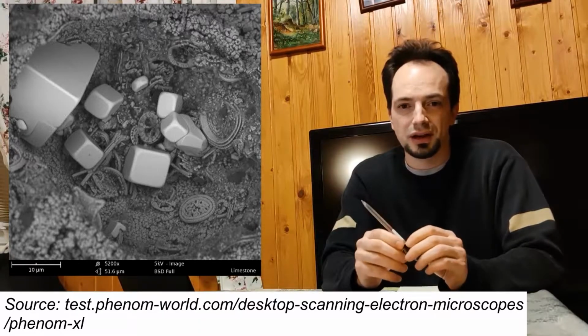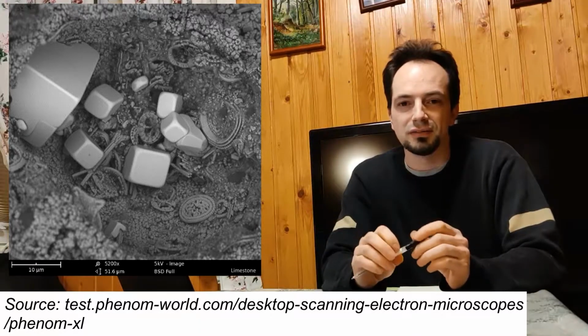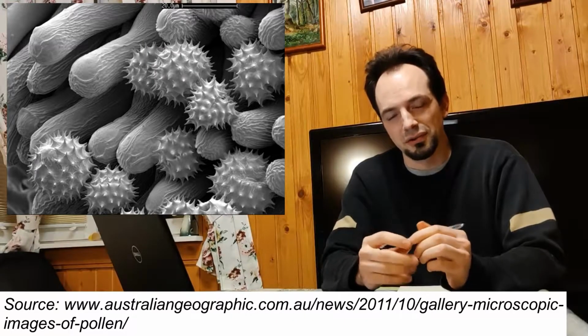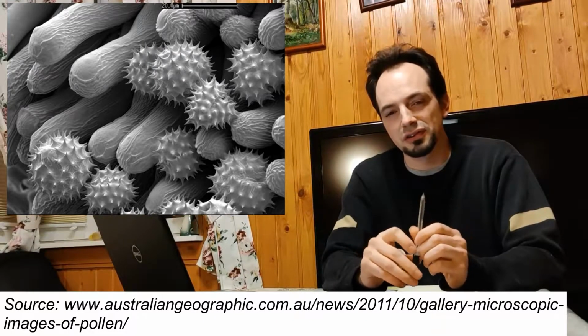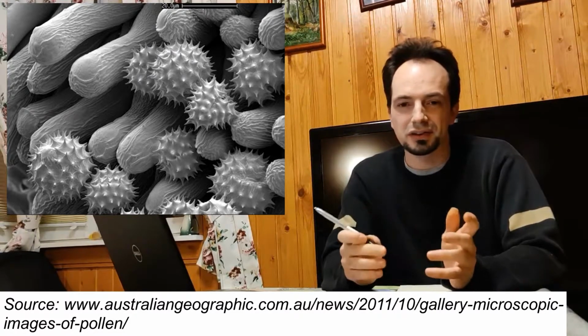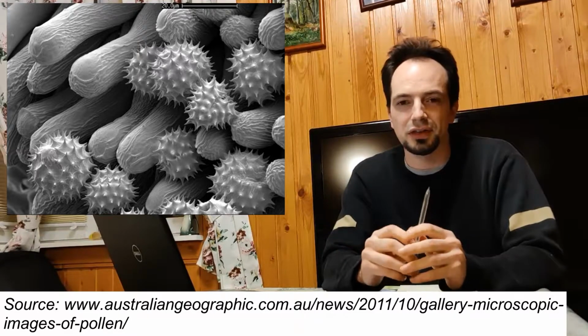I'm almost sure that you have seen such images either in scientific papers or in the news or somewhere else on the internet, because they look like ordinary photos, grayscale photos, and they have all the distinct features of ordinary photography: shadows, highlights, and so on. They even have depth of field effects, blurred backgrounds, and so on. So they look exactly like ordinary photos in grayscale, but they are not, and they are not obtained by any means of optical imaging techniques.